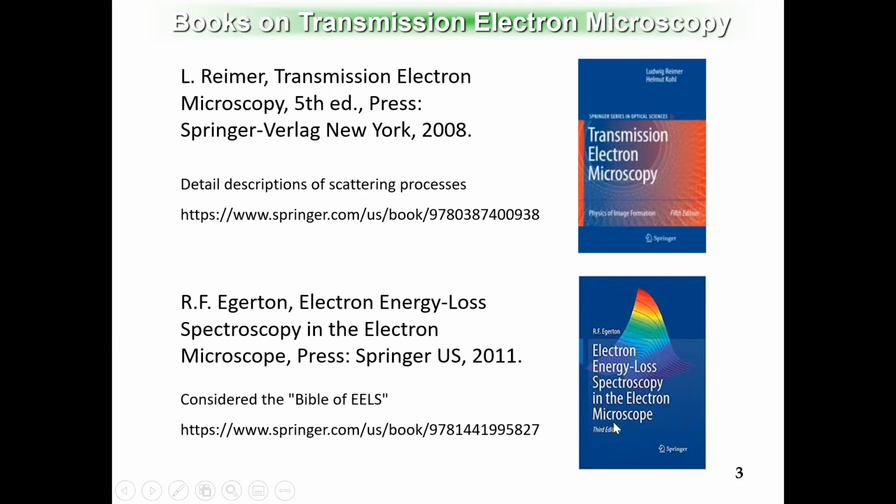As you know, with electrons as the probe, just like X-ray and neutron, you can do all different kinds of techniques. I will mention many of them, and hopefully it will not overwhelm you, but there are so many different kinds of methods built on it. I got a lot of information from those two books in today's lecture content, so if you want to read details, please check those two books.